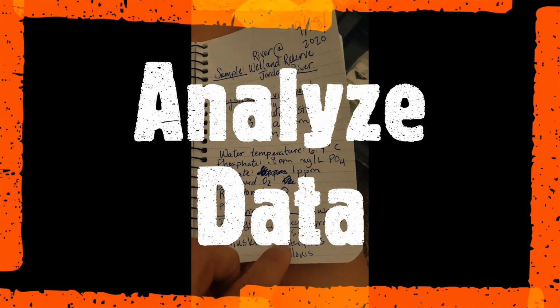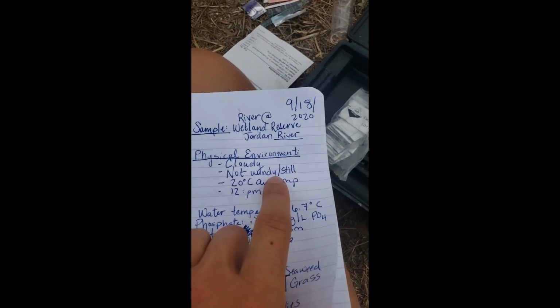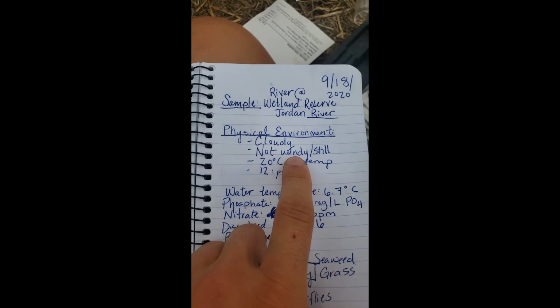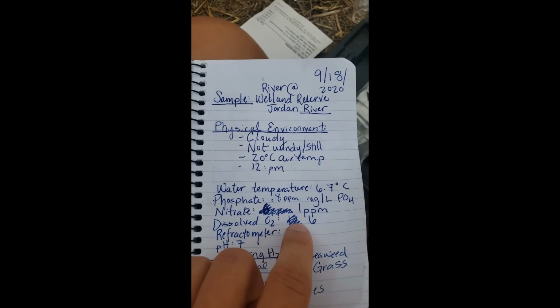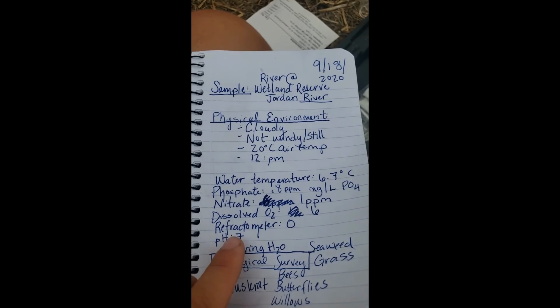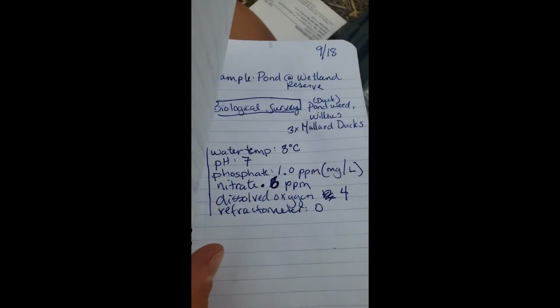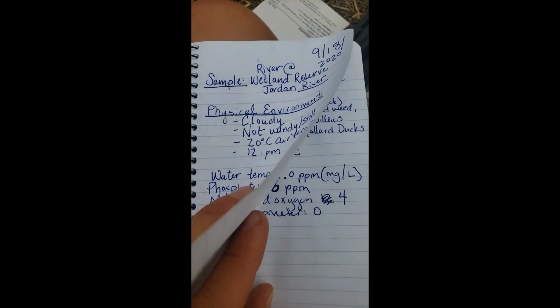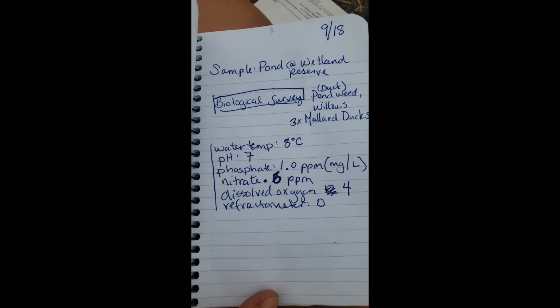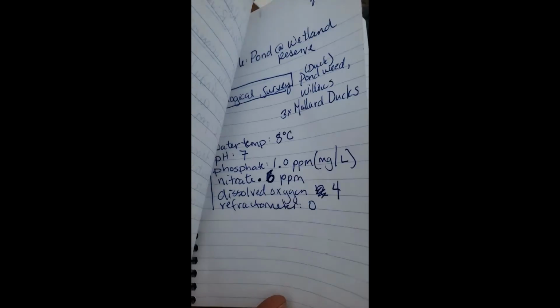Okay, so now taking a look at all the data we collected, we know that today was cloudy. It's starting to pick up a little bit windier now, so I wonder even if that would cause a different, my guess is it would cause different dissolved oxygen. Sometimes when there's more wind, more oxygen gets incorporated into the river. But as it was, we found that the water temperature was a little bit warmer in the pond. The pH was about the same. We had more phosphate in the pond here at 1 than we did in the river. We had more nitrate in the river than the pond, which is kind of interesting. We had more dissolved oxygen in the river than the pond.